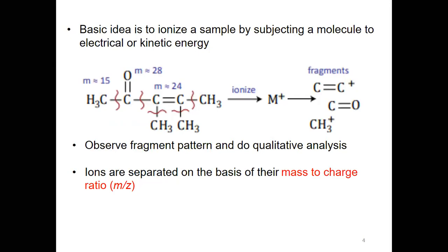So the basic idea is to ionize the sample by subjecting a molecule to electrical or kinetic energy. What is happening there? Electrical energy will be applied, and the molecule will undergo ionization.